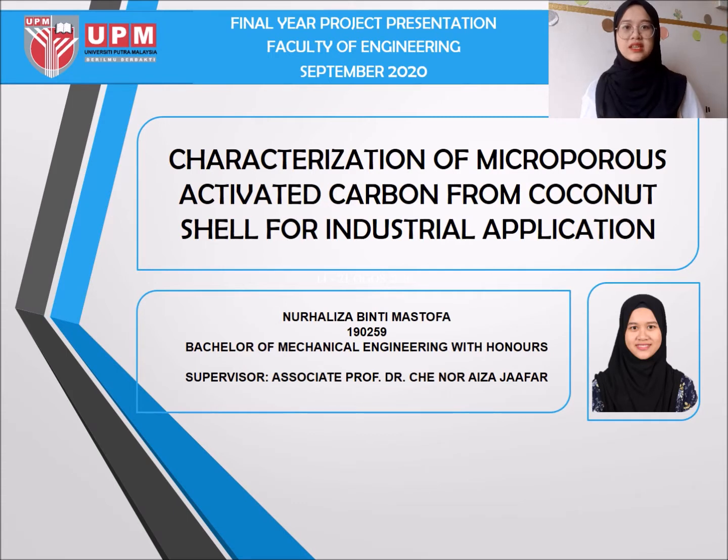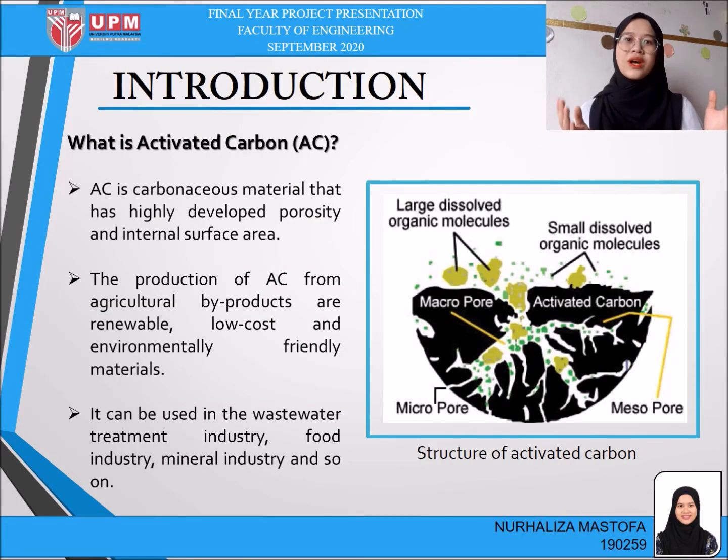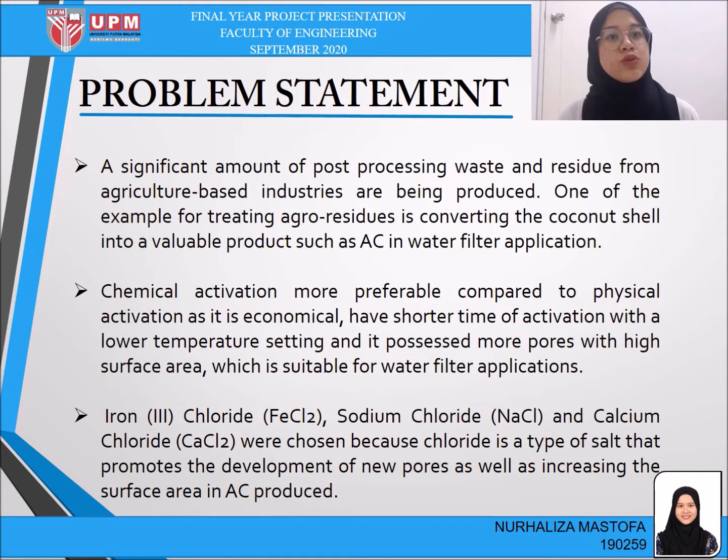My project is entitled Characterization of Microporous Activated Carbon from Coconut Shell for Industrial Application. What is activated carbon? Activated carbon is a carbonaceous material that has highly developed porosity and internal surface area. The production of activated carbon from agriculture byproduct has received much attention as it is renewable, low cost, and environmentally friendly material. Next is the problem statement.